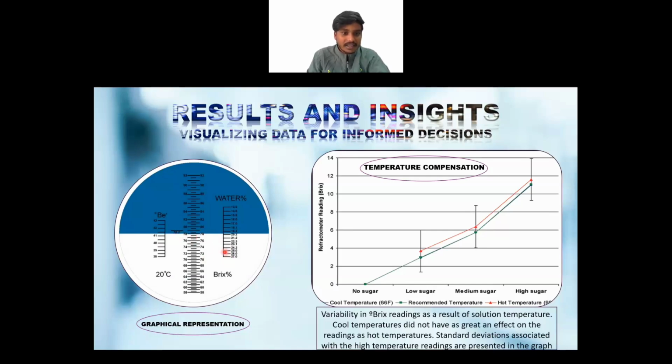and going to the scales, what it determines. Brix scale. The middle column represents the Brix percentage, which measures the sugar concentration of a solution. Here it is approximately 78.8 percent Brix, indicating the solution is quite concentrated in sugar content.